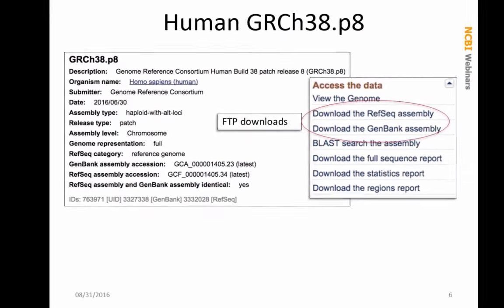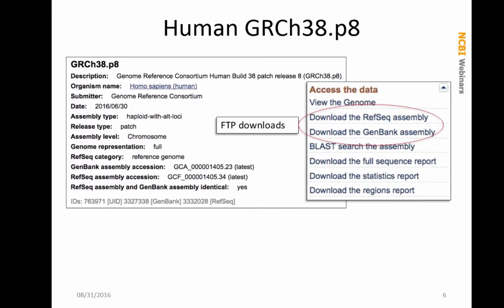If we look at a page — this is the one for the human assembly — the assembly name here is GRCh38 patch 8. You can download either the RefSeq version or the submitted GenBank version of the assembly by following these links. I am not going to go over the full contents of the assembly pages in this webinar, because we are mainly talking about the FTP site and how to get data out of there.